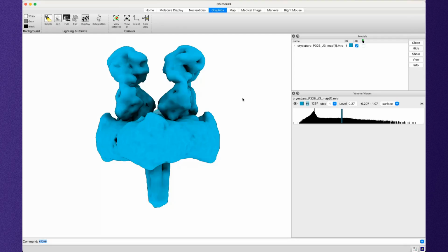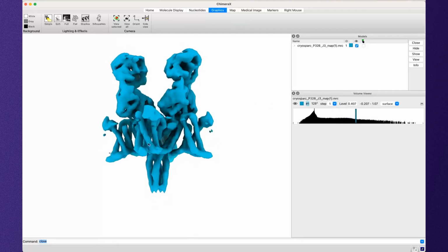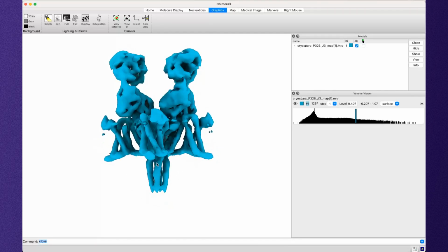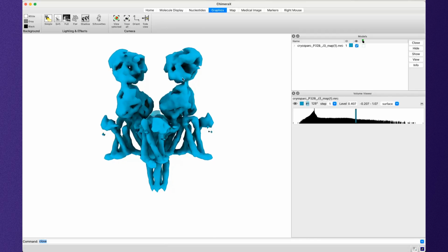And there's more illustration of this in the guide if you're not understanding. But basically the idea is we want to segment out any regions that we think will move independently of each other. So let me give a concrete example here. If we contour down a bit, we know that these helices flex back and forth. We know that this transmembrane domain is going to flex up and down at each of its extrema, but is probably relatively stable at the core. And we know that these fabs shouldn't be moving relative to the transmembrane domain, right? We know that they're attached here, but they might, and probably do, move back and forth relative to each other.